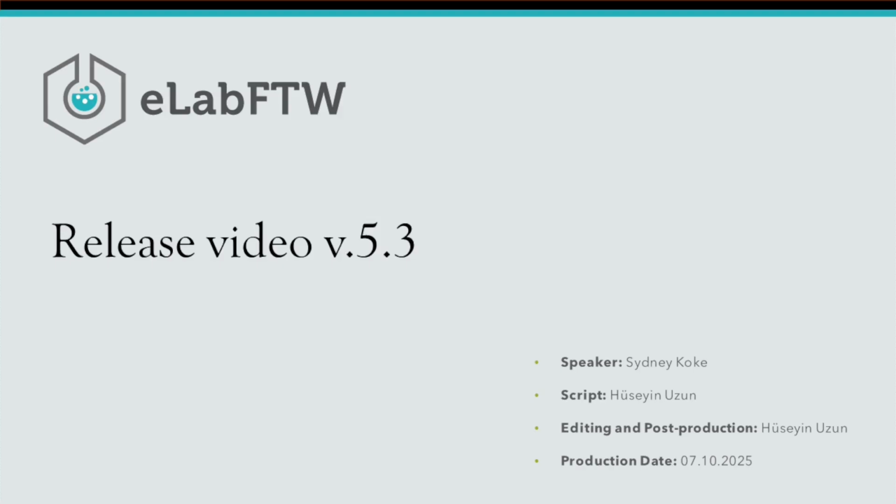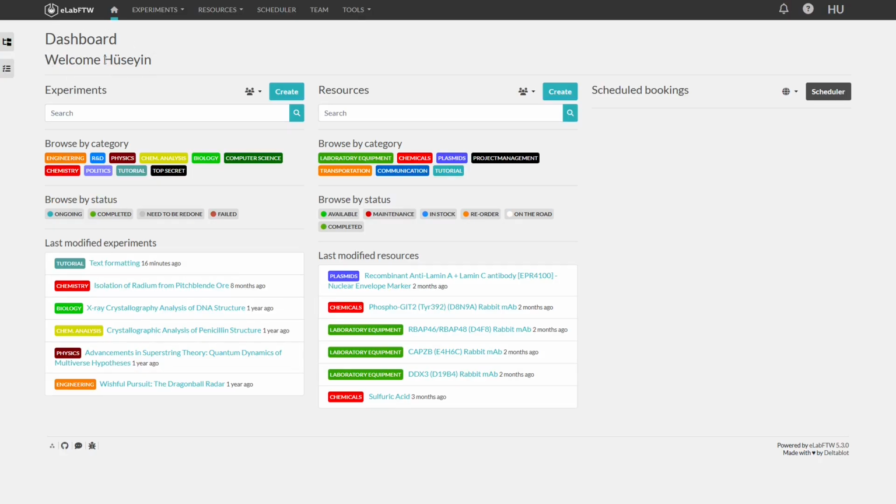Welcome to our eLabFTW release video. In this video, we will show you the newest features introduced in version 5.3. Let's get started. We are now on the eLabFTW dashboard.